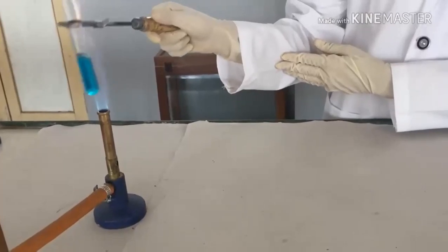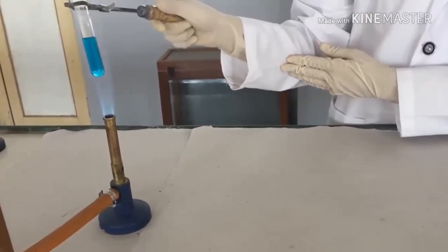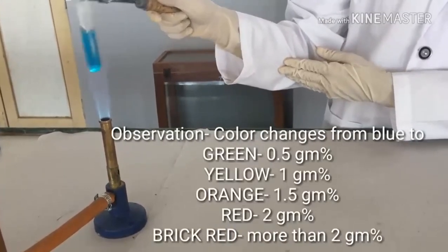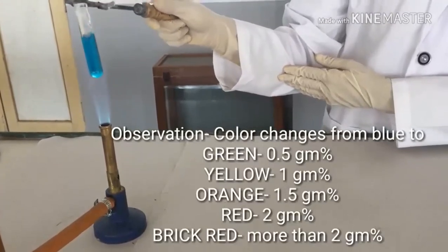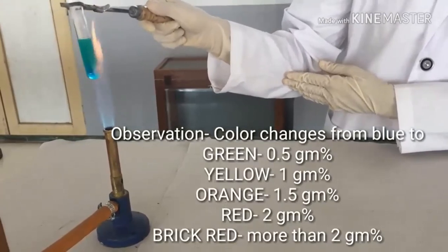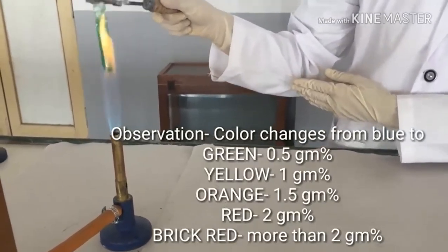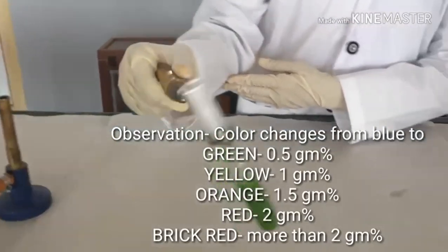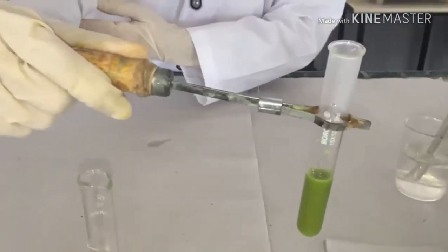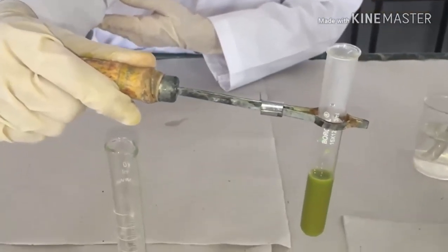Shake the test tube while heating it. There is a formation of a color change which indicates the positive Benedict test.